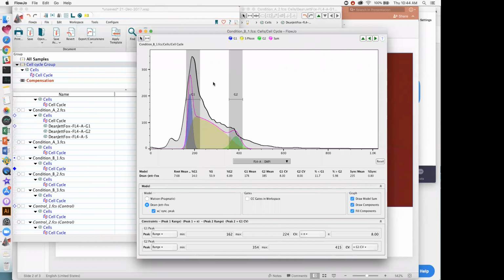But 0.1 and 0.2 differences here in the model RMS are relatively insignificant. Yeah, so if you're under a value of 10, it's pretty good. But again, the RMS, I'm giving you that as a benchmark because it's not going to be the same from model to model or from experiment to experiment.